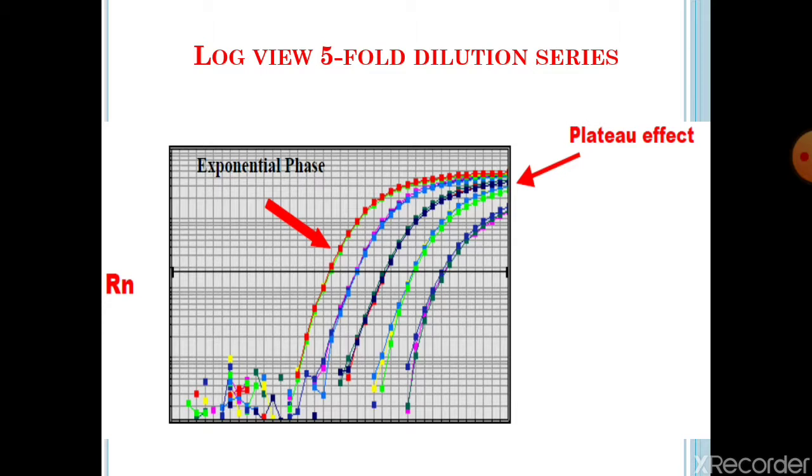Real-time PCR is designed to collect data as the reaction is proceeding, because we are doing the detection in the exponential phase. From this figure you can clearly understand that when we work in the exponential phase, the results can be distinct. So it is more accurate for DNA and RNA quantification, and it does not require laborious post-PCR methods. Got this point?